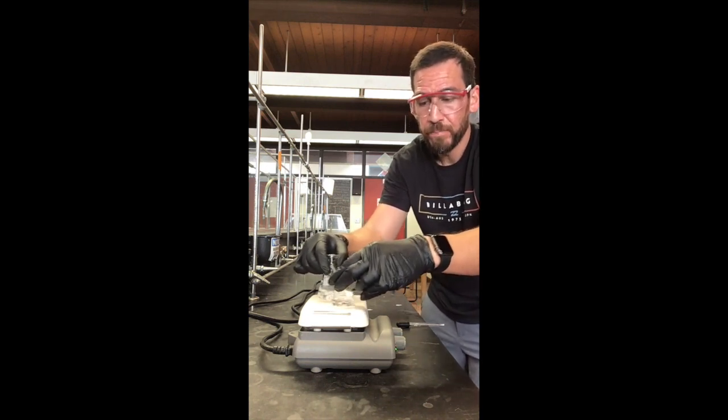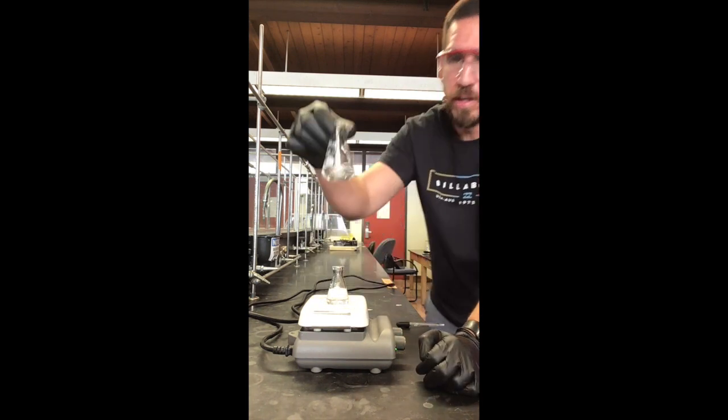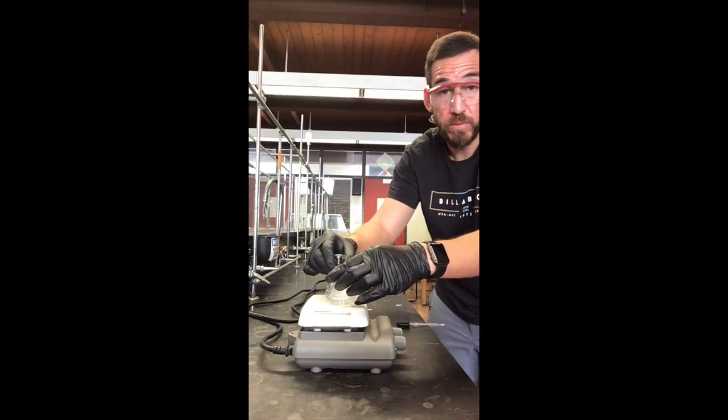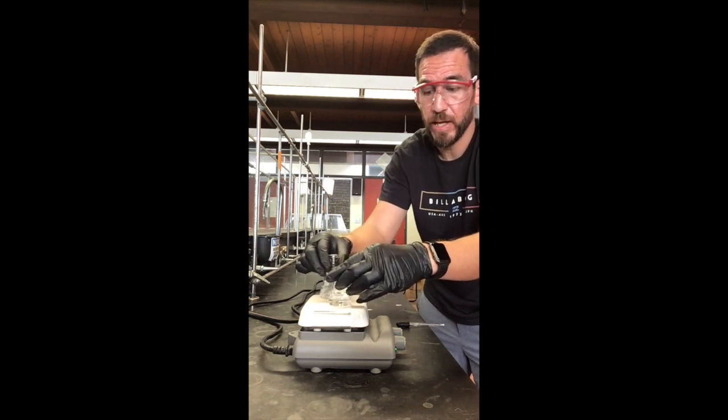And so let's see, we're almost there. It's so close. It's so close. You can see just a little bit there. And so we're going to be patient, and we are constantly stirring, okay?